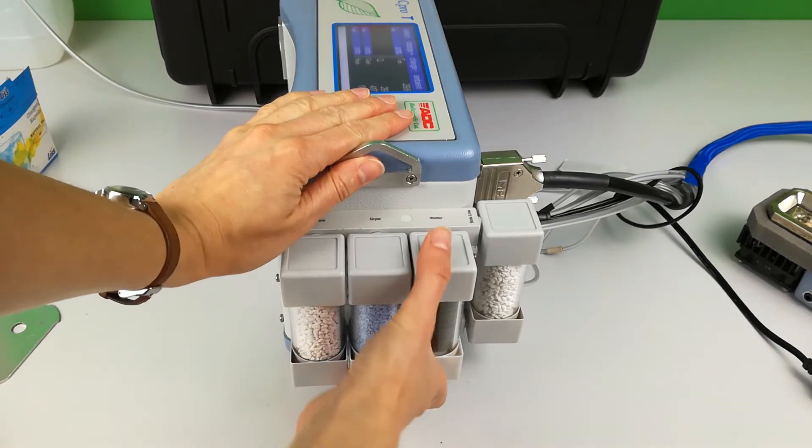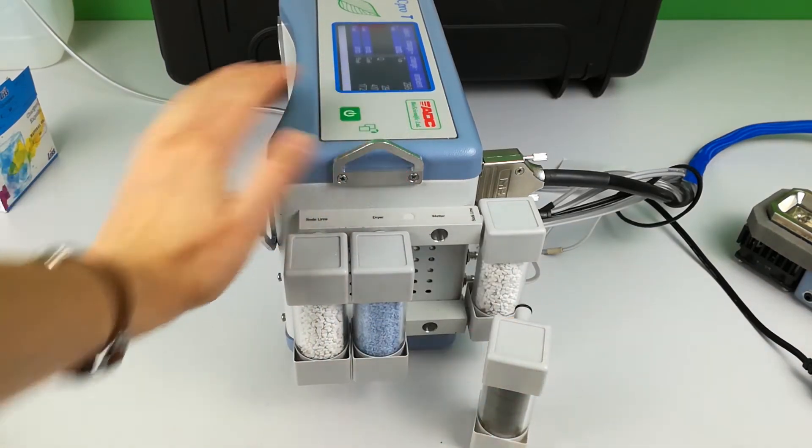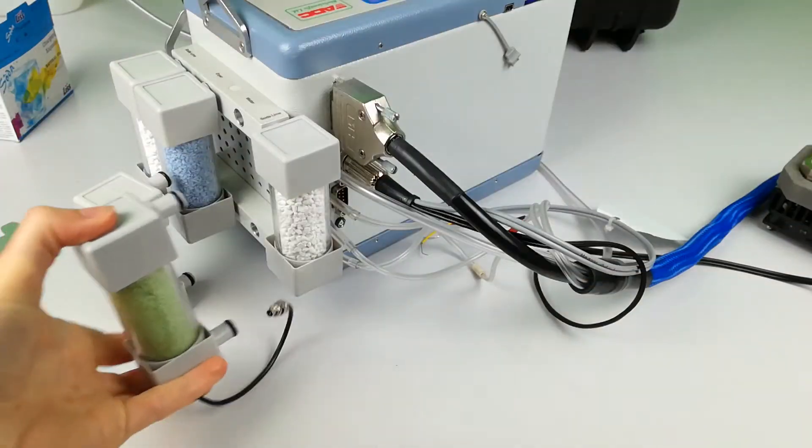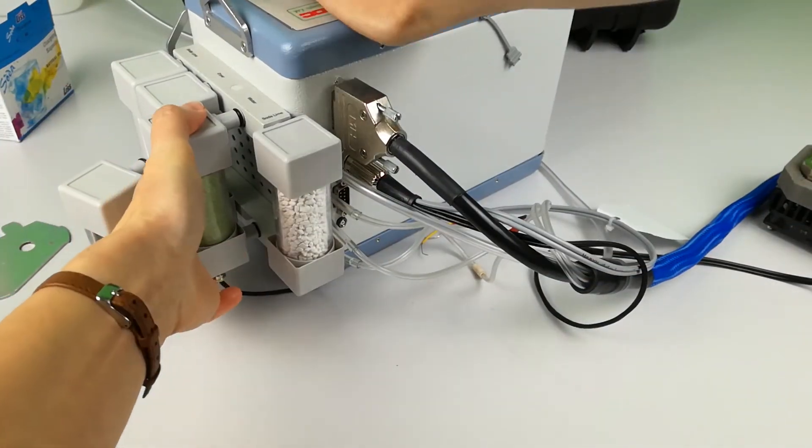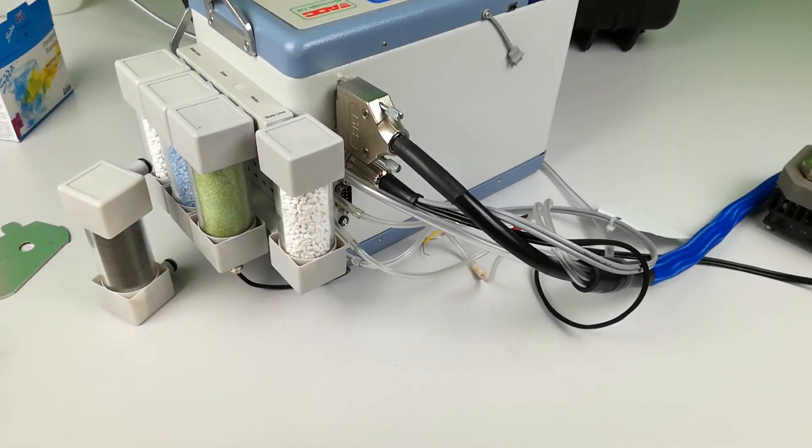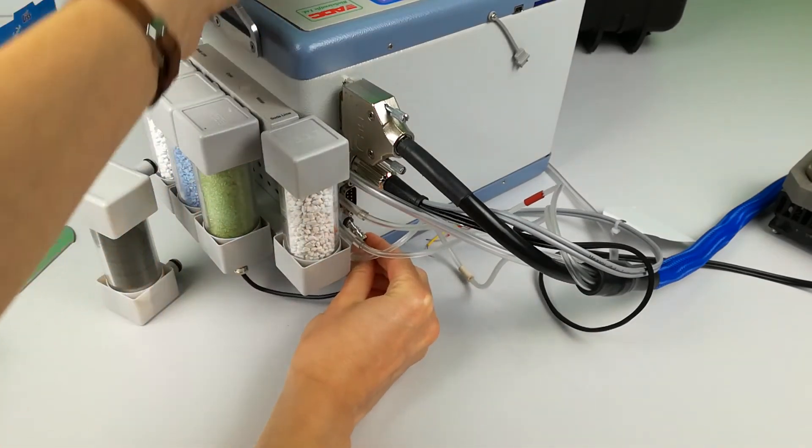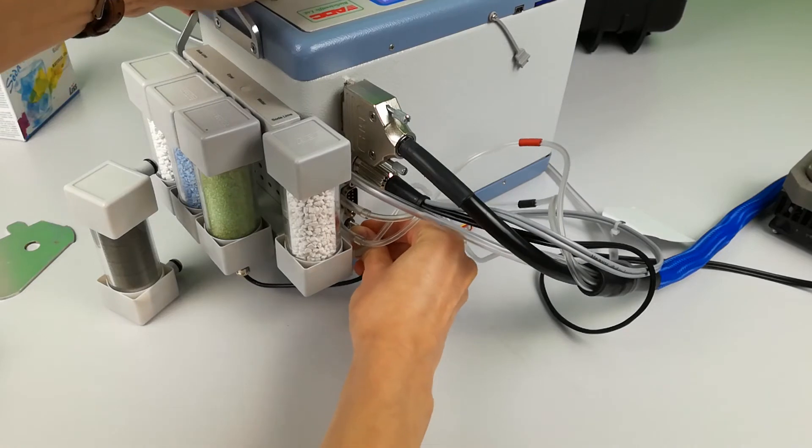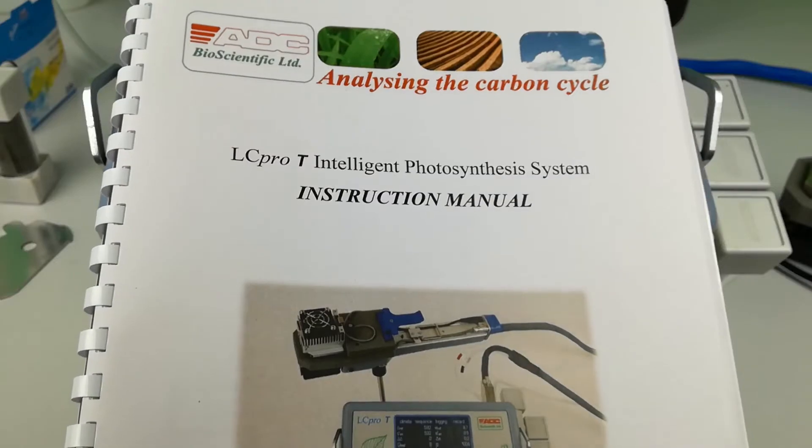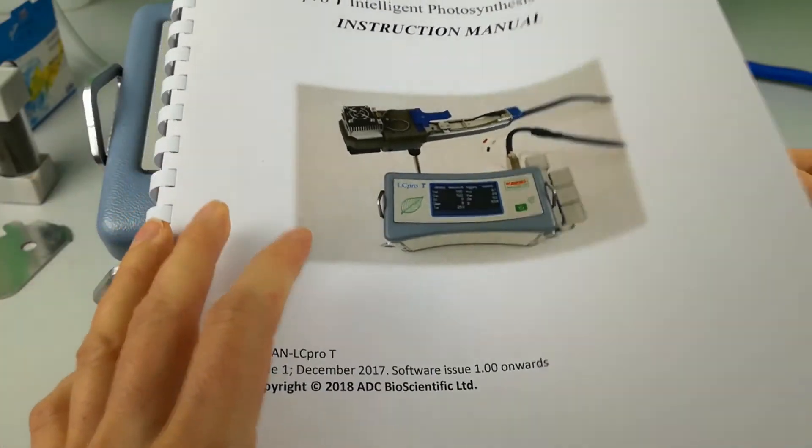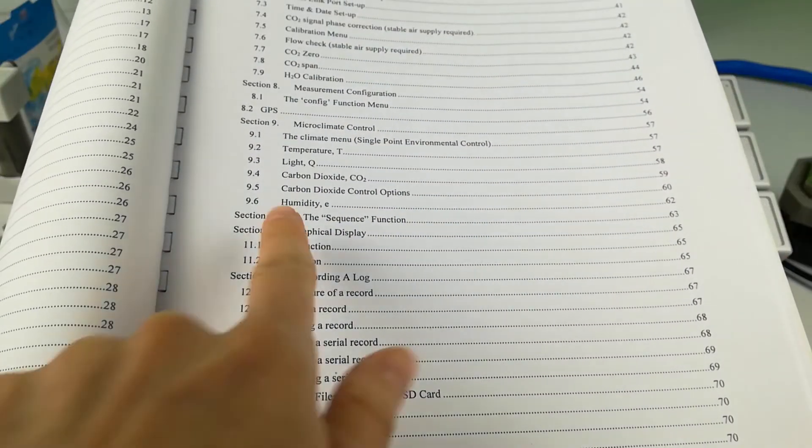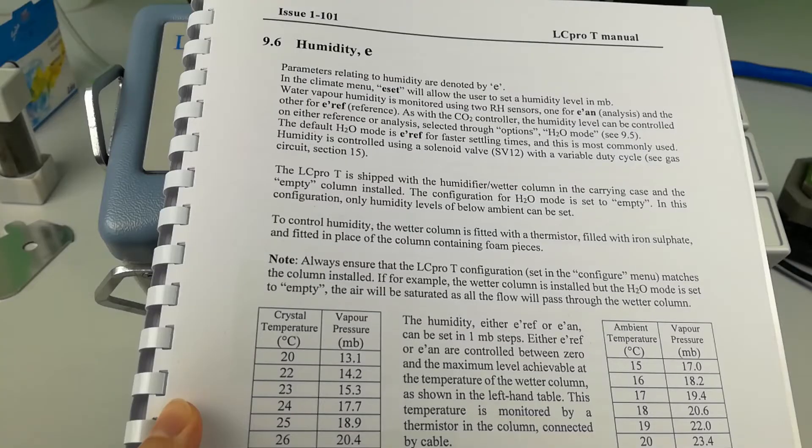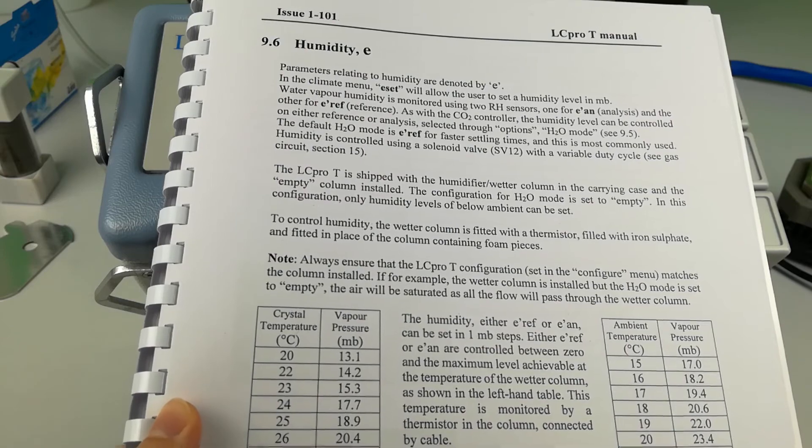Take out the spare column with the foam inside and replace with a filled wetter column of iron sulphate. Attach the thermistor cable to the back of the console and refer to the main manual under the section humidity. In this section 9.6 you will find the reference tables to calculate the achievable values for relative humidity at your operating temperature.